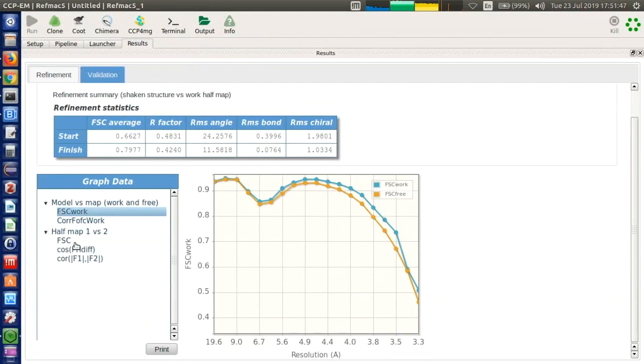What is the acceptable R factor? It's very hard to judge what an acceptable R factor and FSC figure are for cryo-EM refinements, because, as I said in the section on local refinement, they vary with the box size and with the size of the object, and with the resolution. So we don't have a kind of good rule of thumb, like in crystallography, where people know what a good R factor would be. Generally speaking, if I can see the R factor going down, that would be okay. If the R factor is going down, that's definitely a sign that your refinement is working.